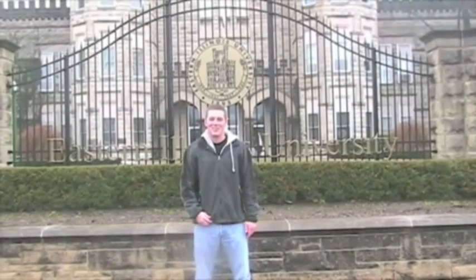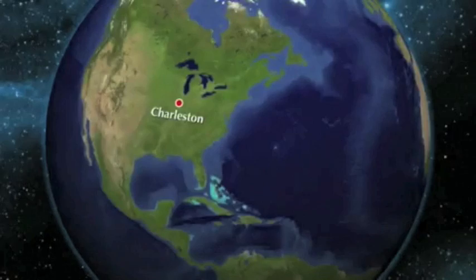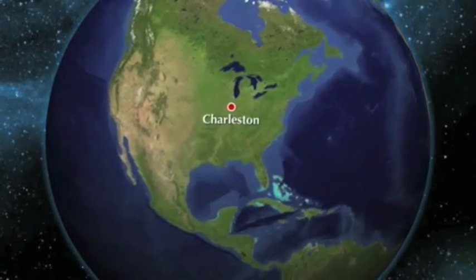Welcome to Eastern Illinois! Let's head over to Glimhall where things really happen! Oh, material testing lab. Let's go on in and see what Brian's doing.